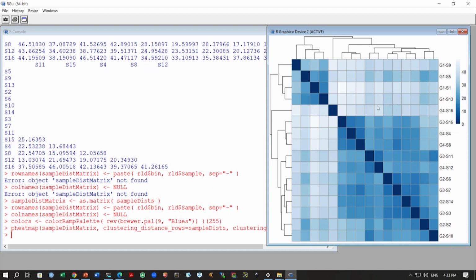Okay. So, this is what we wanted to generate in the first place. This is how we can do this distance based clustering, which can tell us which samples are close to each other and which sample might be an outlier in our data. In the next class we will talk about the principal component analysis and we will generate this principal component analysis plot, and once we are done, then we can move into the bias correction part. Thank you very much.